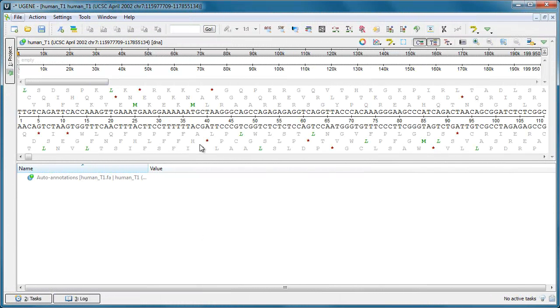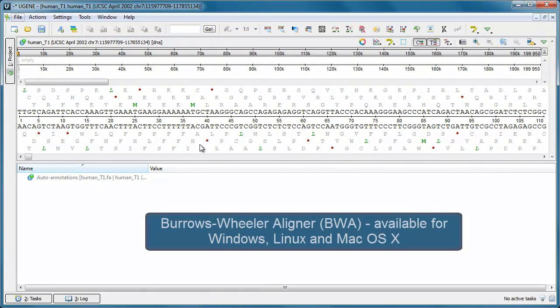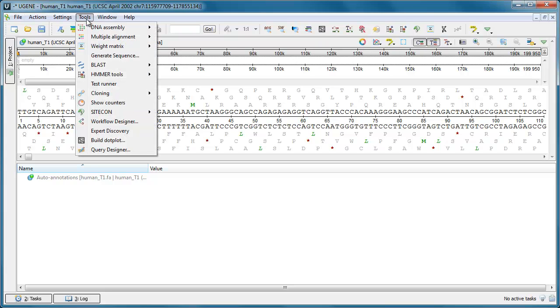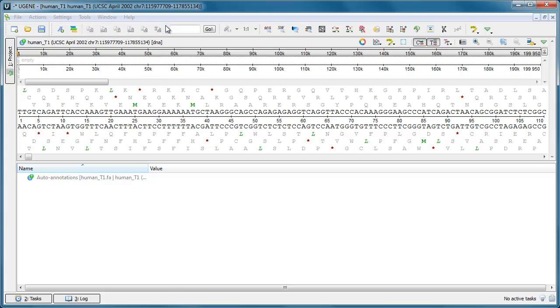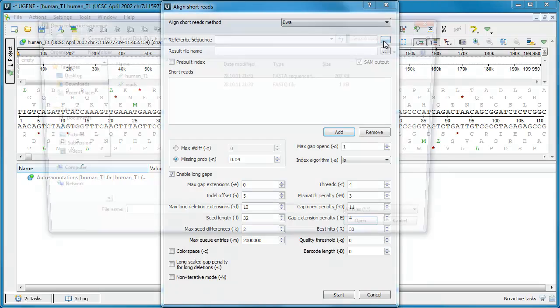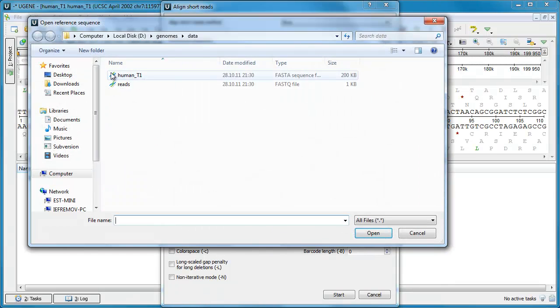The Burrows-Wheeler Aligner, or BWA, a popular program for aligning short reads to a long reference sequence, was embedded into UGENE as an external tool. To use the program, select the BWA method in the Align Short Reads dialog and provide the input reference sequence and short reads.